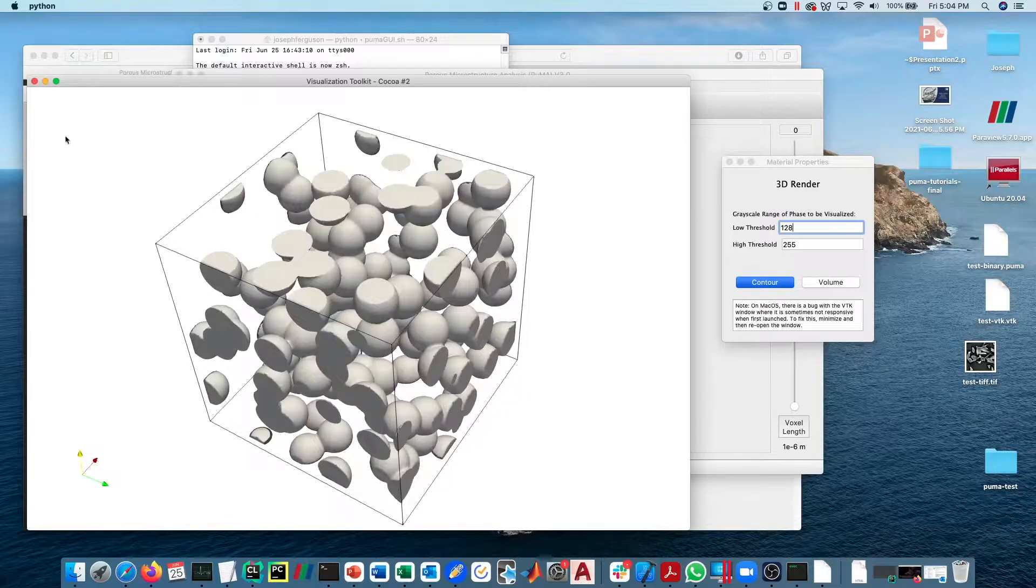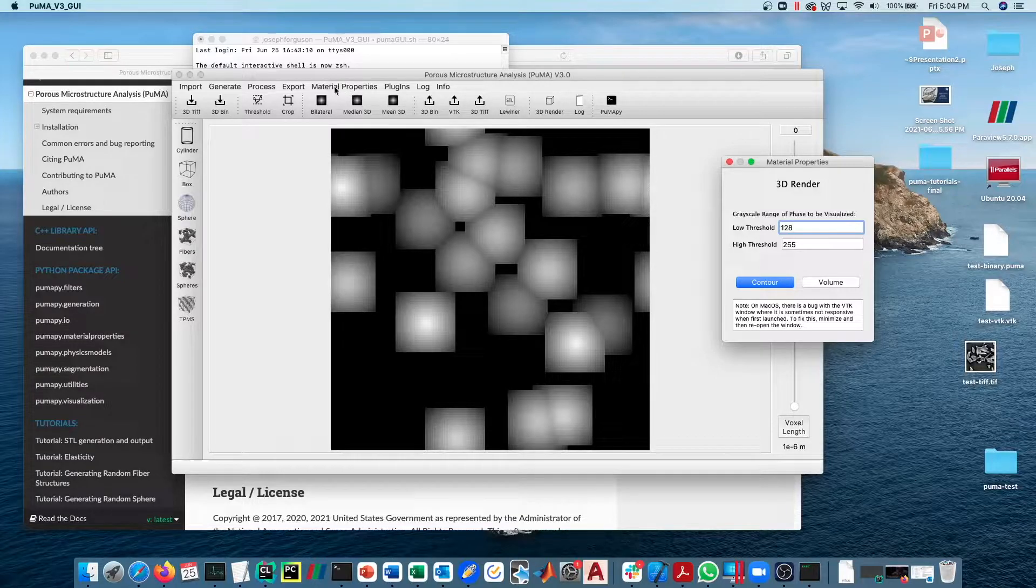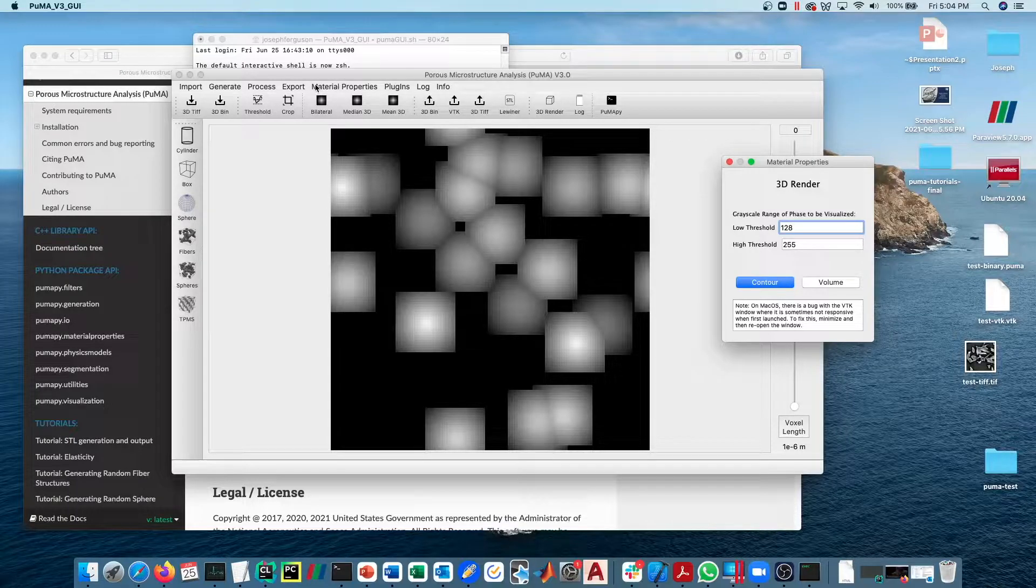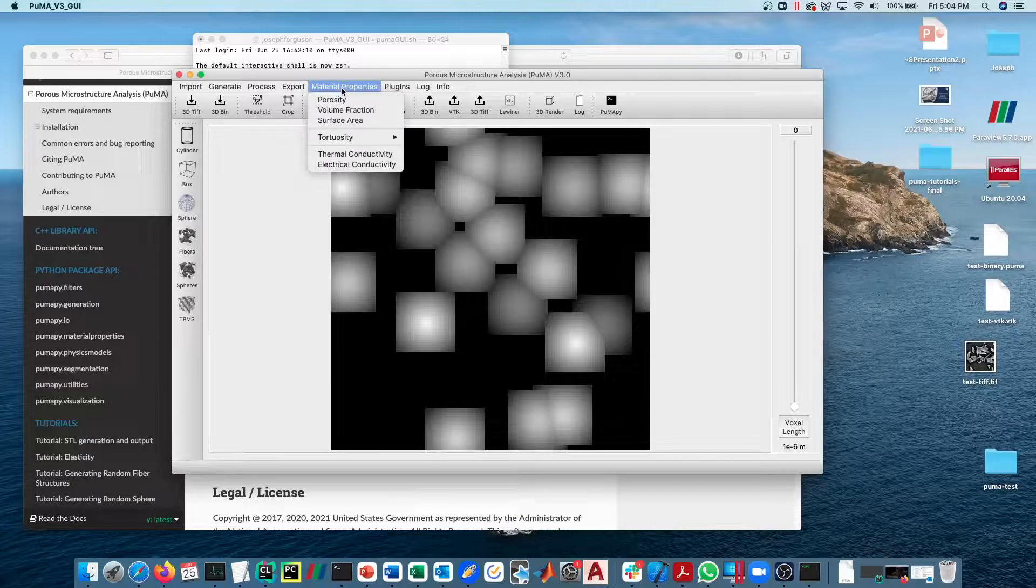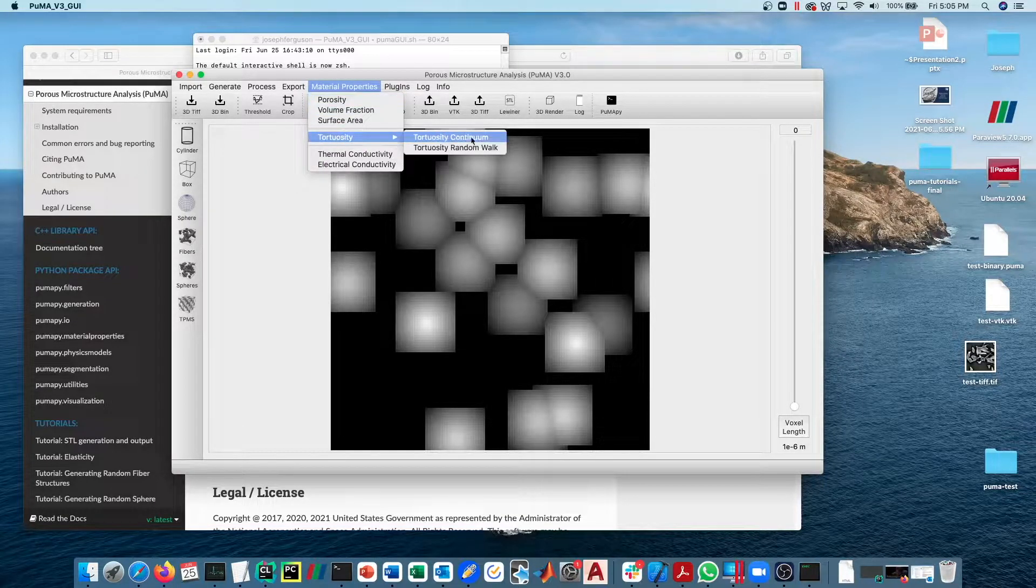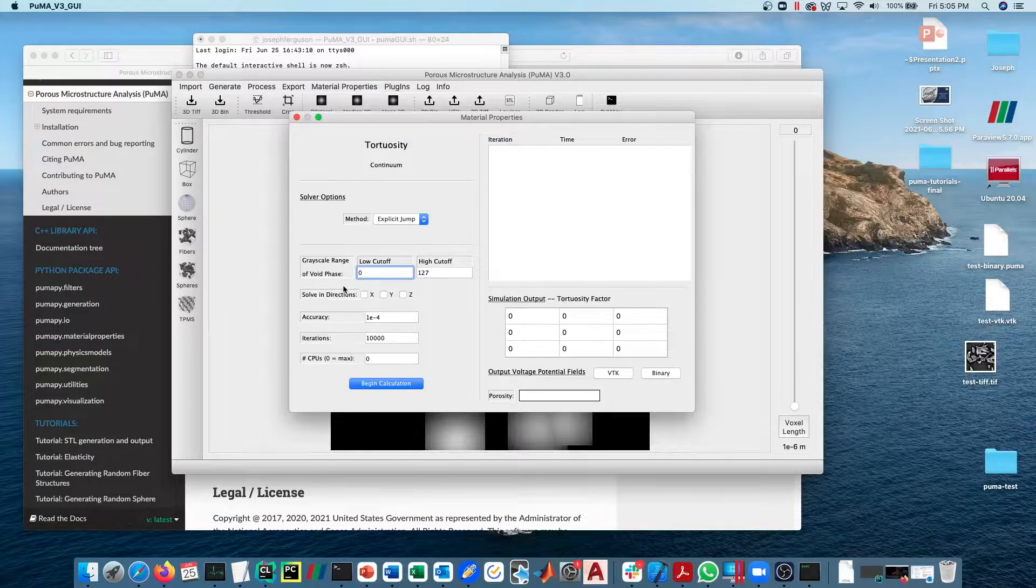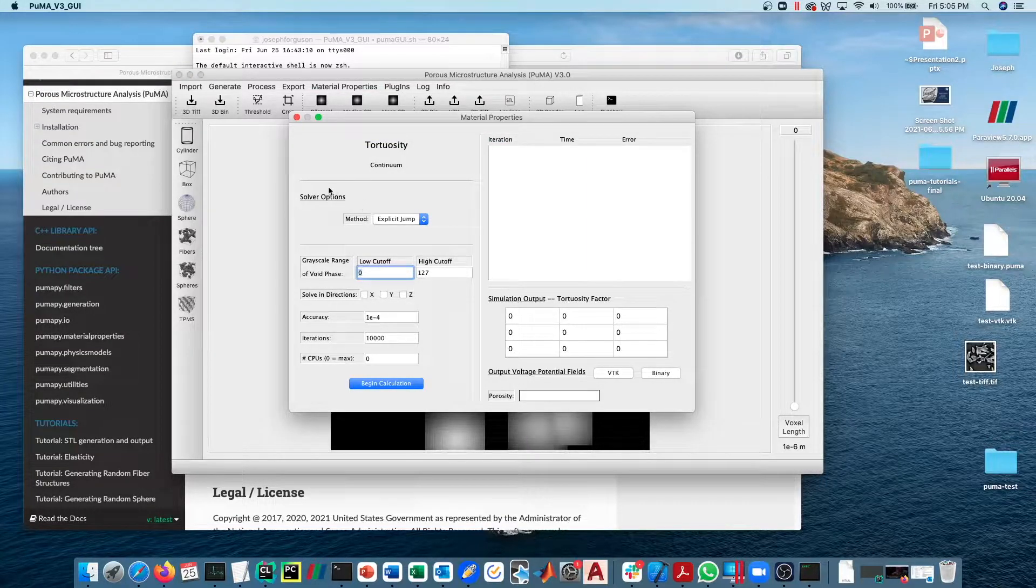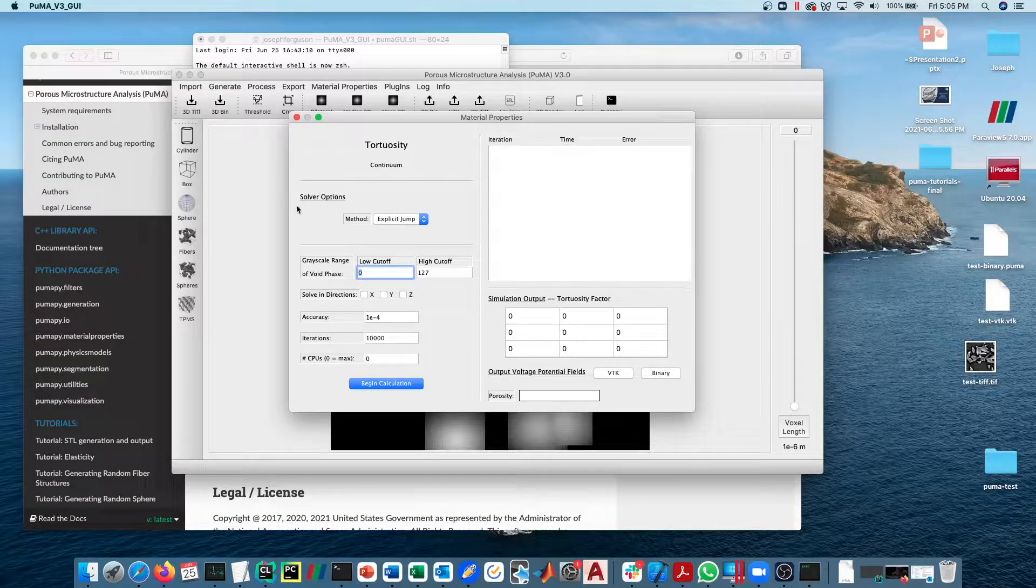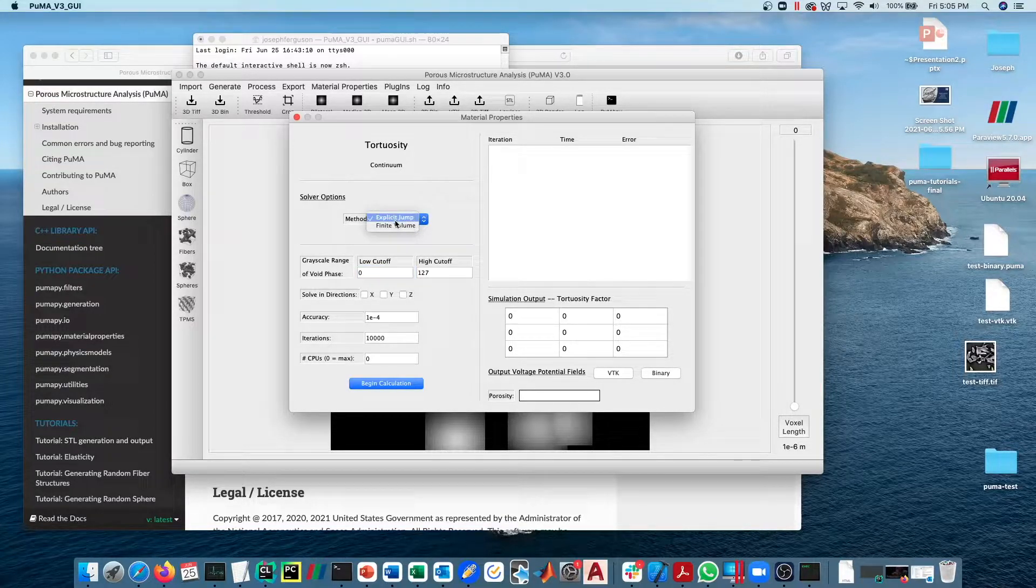Let's go ahead and calculate it. We'll calculate it using both the continuum solver and the particle solver. First, we're going to open up Material Properties and then Tortuosity, Tortuosity Continuum. The first thing that you'll find here is what solver method you want to use.